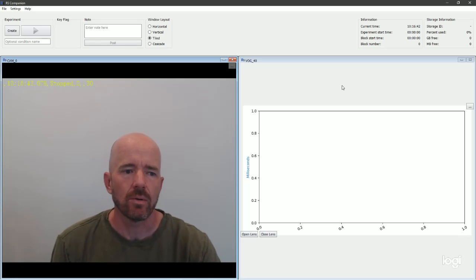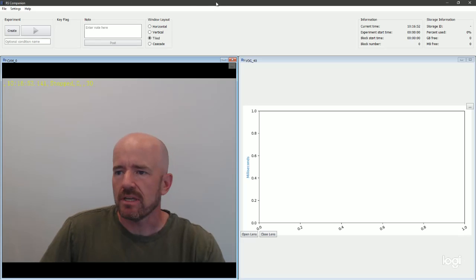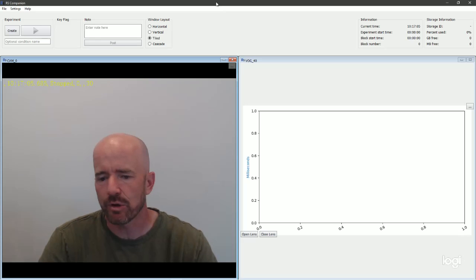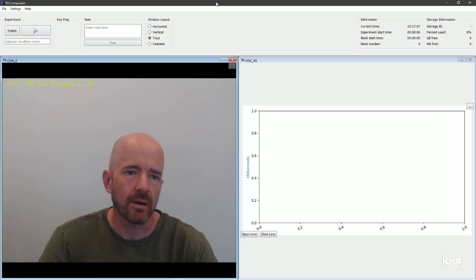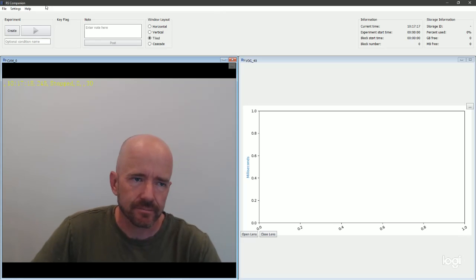Hey, in this video I just want to walk through the new Red Scientific companion software and show you some of the exciting features that the newest version has to offer. So what you're seeing here is actually the new software. It supports video capture, not audio yet, but will in a version forthcoming. And then it supports multiple devices, which is exciting, multiple cameras, new languages, better flagging, better experimental control. So I just kind of want to walk through this and show you these exciting new features.